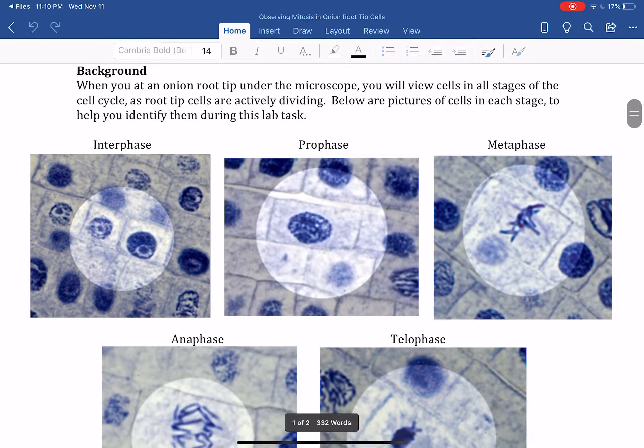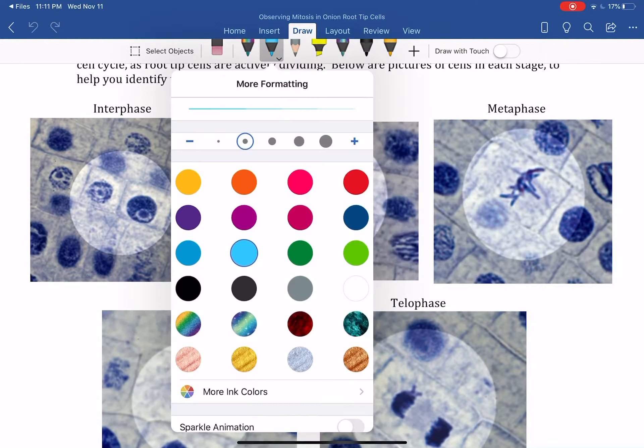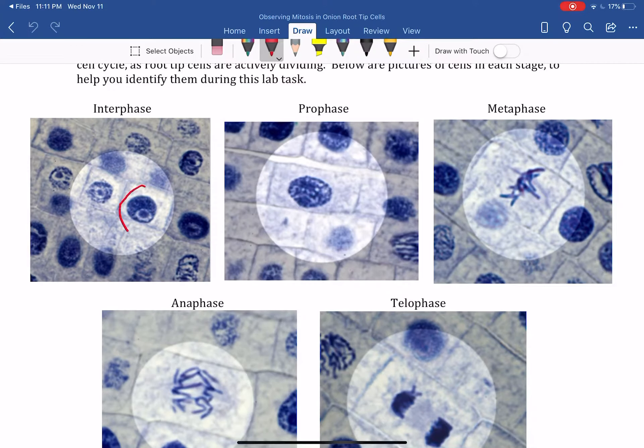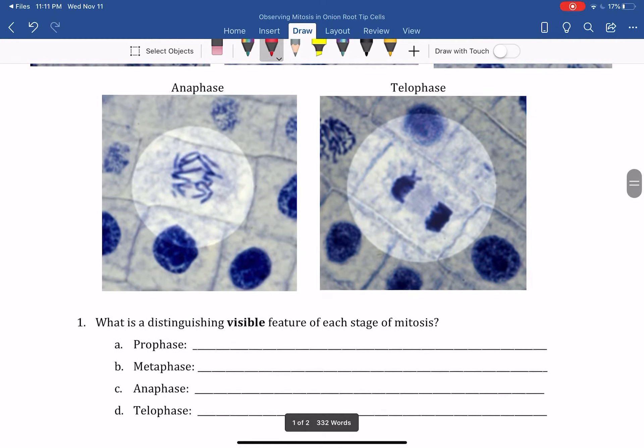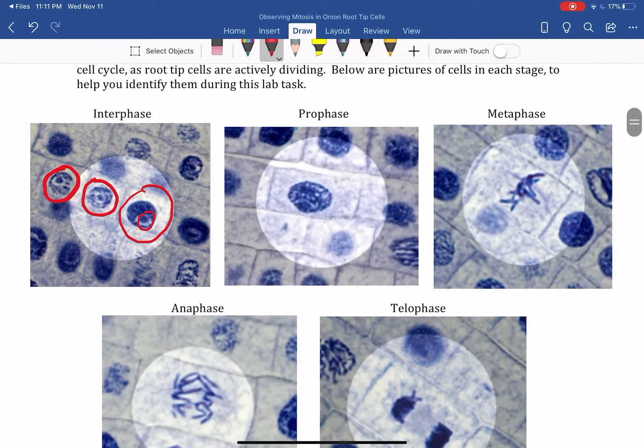You've got interphase, prophase, metaphase, anaphase, and telophase. In interphase, notice that you still see the nucleus - that's the cell. The nucleus is right here, that's still intact. It hasn't started to break down yet. So that's definitely an interphase. This is a little bit of a later interphase. I don't really see any other real obvious interphases there.